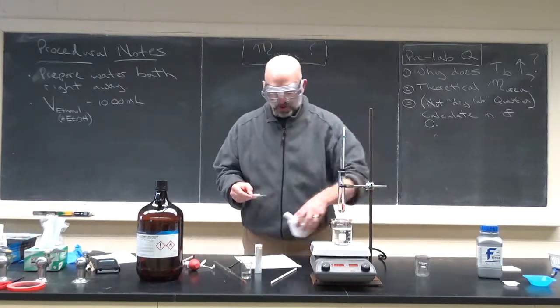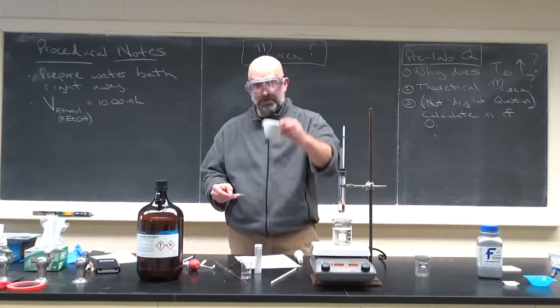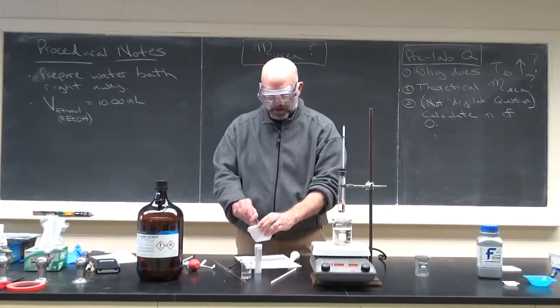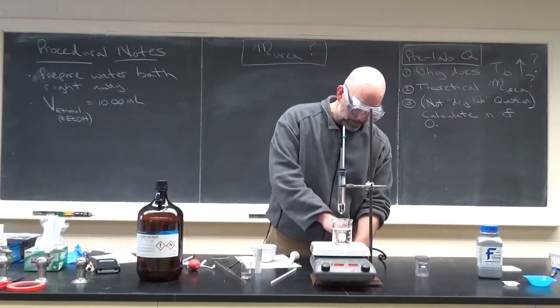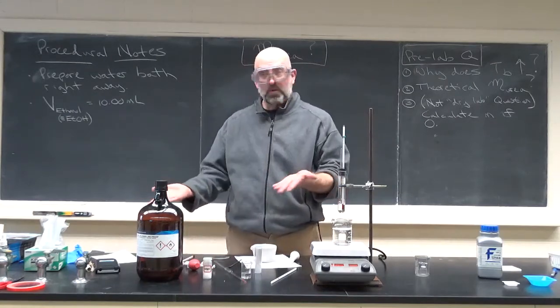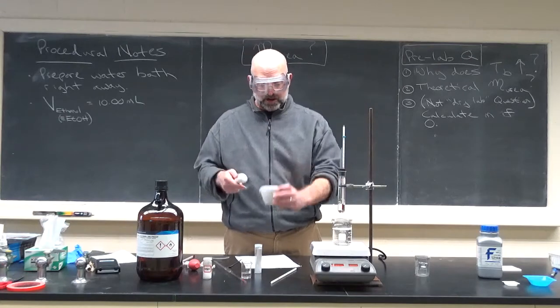So we're going to take a mortar and pestle. This is the mortar, this is the pestle. So you'll take some of this. You only need a gram. I have no idea how much I put in there. So put some in the mortar and pestle. This is very non-toxic stuff, so it's very safe. I could be wearing gloves, but you don't need to. So I put some urea in here.